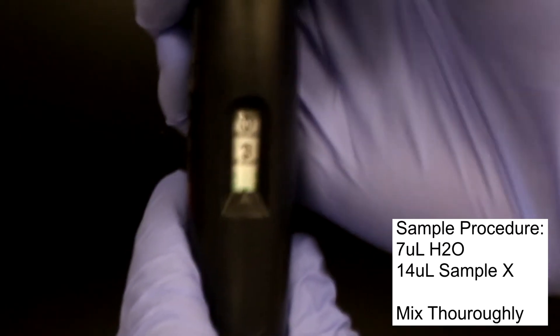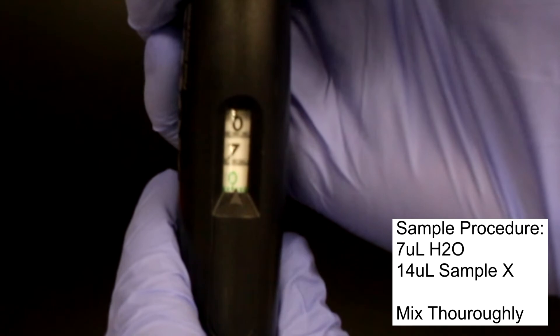This example procedure requires 7 microliters of water, to which the pipetter's volume is set.